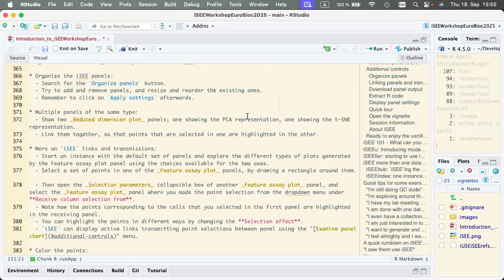Okay. So you can enforce it a bit. You can think of putting it in some form. And if you work with microbiome data, what a coincidence that Giulio just came in. Giulio, that has nothing to do with us in terms of affiliations and stock options on iSEE, because there are none.